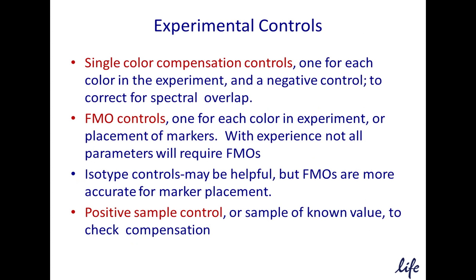In the experimental design, several controls are needed to ensure accurate results: compensation, fluorescence minus one, and biological. Again, compensation can be performed using cells, antibody capture beads, or a combination of both, and requires the use of the same reagents used in the experiment. Compensation is best set using software as opposed to compensation manually using graphics. Compensated data may result in an unexpected distribution or spread of data that precludes the adjustment of the signal with the autofluorescence, and this is why FMO controls are used to allow a precise definition of positive and negative populations.